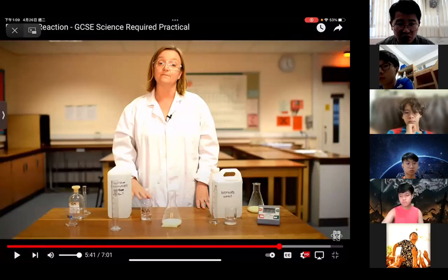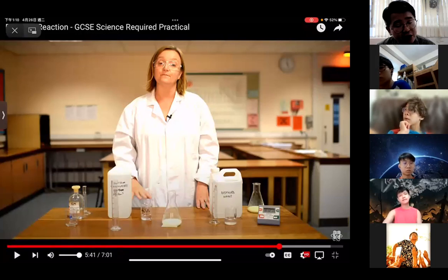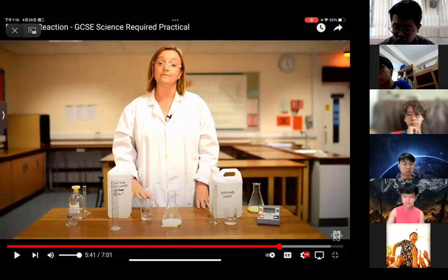The reaction still continues even though you think your own part has finished. I just place it here and let them go. Okay, you get my point? We are not using this to keep track of the whole progress of the reaction. We design a special moment at which we have an easily observable stage.